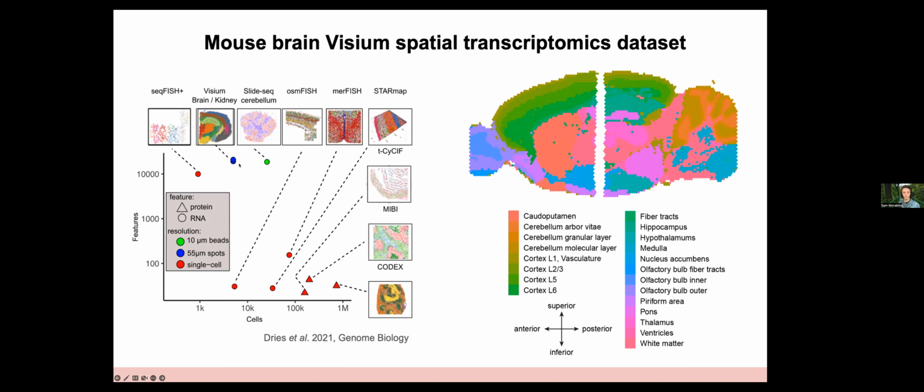It's important to note Visium is not a true single cell method. You have essentially a grid that covers your tissue sample, and anything in a spot at that point in the grid is going to get a barcode. So that could be multiple cells. And for neurons, which might be large cells, one cell could actually be in more than one spot. So it's definitely a computational nightmare in some ways, but this data set is still very interesting.